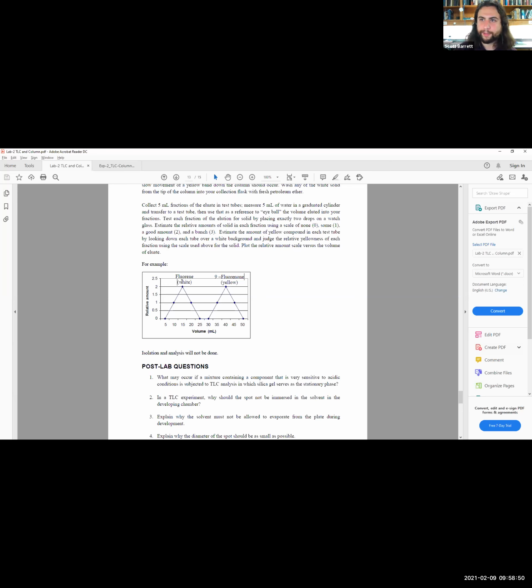If you saw this in the lab, you would notice by a TLC plate, when you first use this none, you wouldn't see a spot at all when you run your TLC. Then you'd see a little spot. My speaker just died, so hopefully you guys can still hear me.